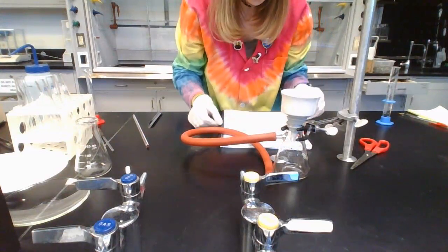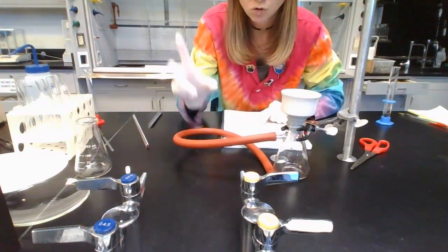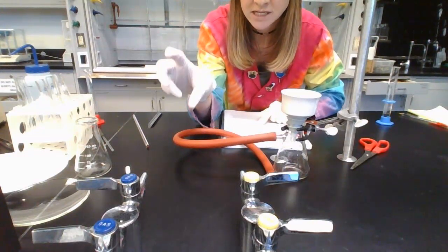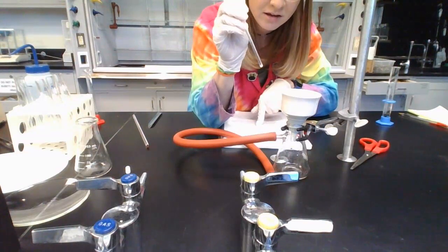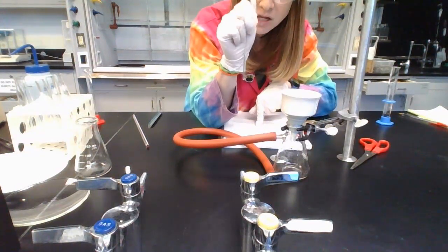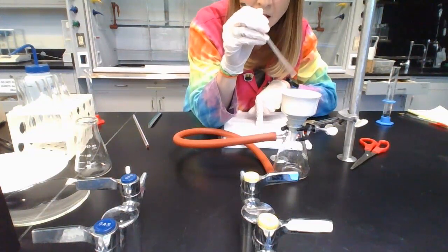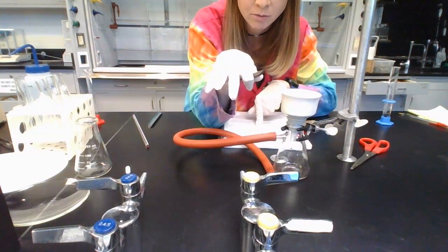Okay. And we're going to add 10 milliliters of the ice cold water. So the water that had been set in the beaker. Pour a little bit in there. Then you're going to grab your glass stir rod and gently, carefully, you're going to agitate it. What we're trying to do is use that ice cold water to rinse the outsides of all these aspirin crystals. We want to get rid of any impurities or any other chemicals that are stuck.